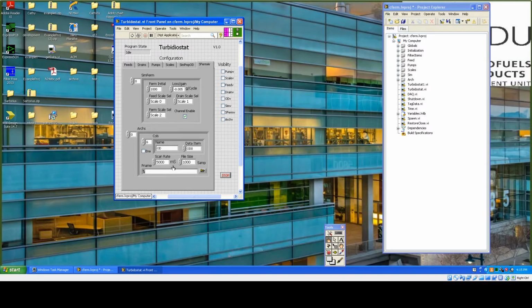Now, because this is a single thread archiver, it's going to write files using the same logical computational thread that it uses to gather data. For other archivers that are a bit more sophisticated, like the ones we use for the ABEC system, the gathering of data from the running system and the writing to disk are two separate logical operations handled by different threads.